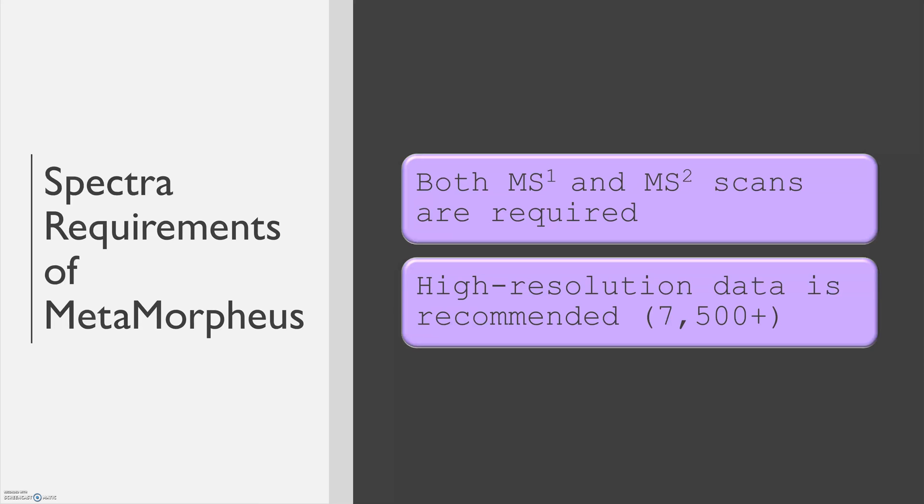Spectra requirements for Metamorpheus include that both MS1 and MS2 scans are present. High-resolution data is also recommended for the most optimal results, 7,500 and above.